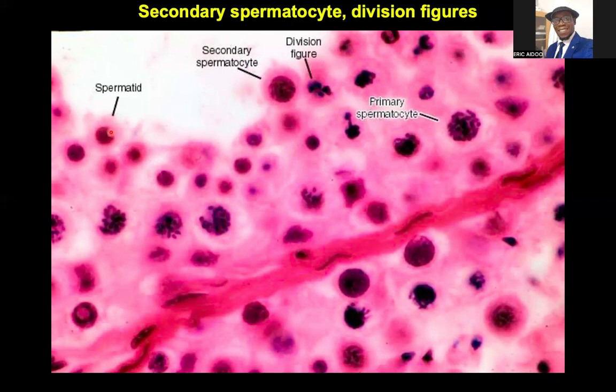This is a very early stage. The late stages will have the oval shape. You can even see one undergoing some cell division. So that is how this looks. This is also another compartment of a different seminiferous tubule, so this will also be the boundary layer for that one, with all these cells in succession going deep into the lumen.